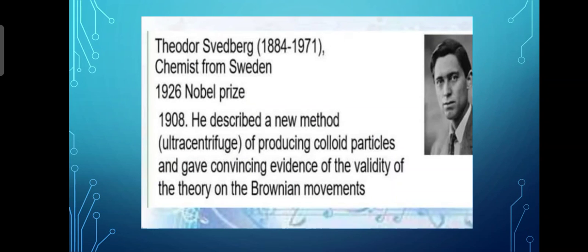The first analytical ultracentrifuge was developed by Theodor Svedberg in 1926. He described a new method of ultracentrifugation for producing colloidal particles and gave convincing evidence of the validity of the theory on the Brownian movement.